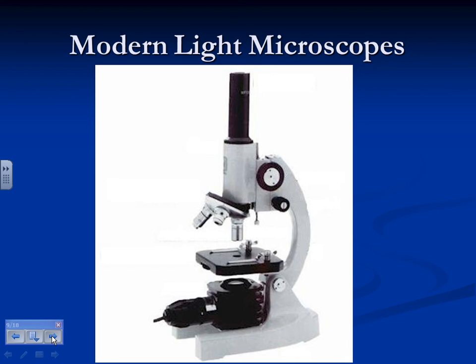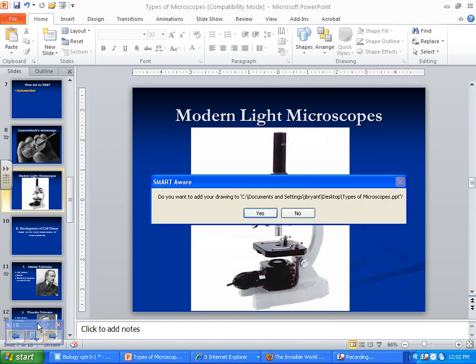So today, we're gonna go over some parts of the microscope. We'll see what you guys know and see what you get. We got just a few minutes here.